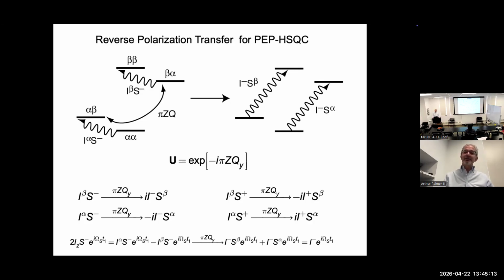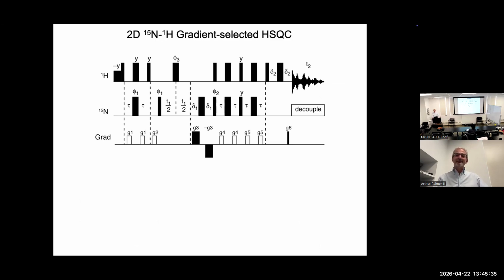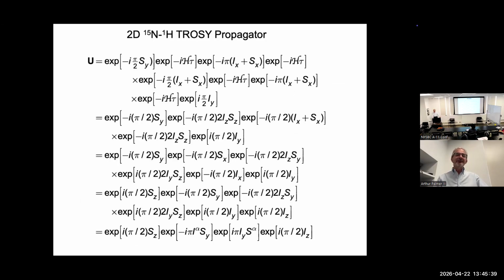I asked Christian if this just was for illustration, and he says no, he has designed pulse sequences in the past by looking at these energy level diagrams and figuring out he needs some selective rotation, and then go back and figure out a pulse sequence that will accomplish that. But he's way smarter than I. Here's how it works if you add gradients.